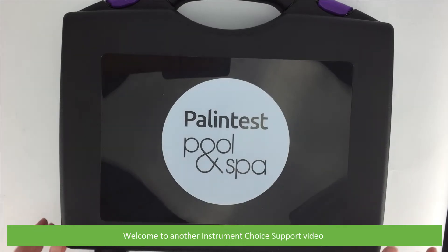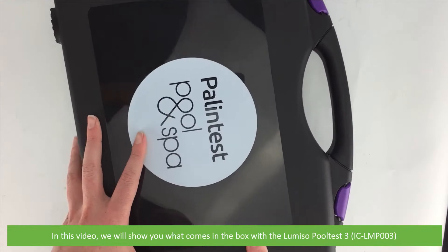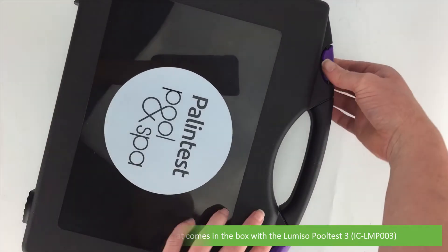Hi and welcome to another Instrument Choice support video. In this video we'll show you what comes in the box with the Lomsio Pool Test 3, the IC LMP003.